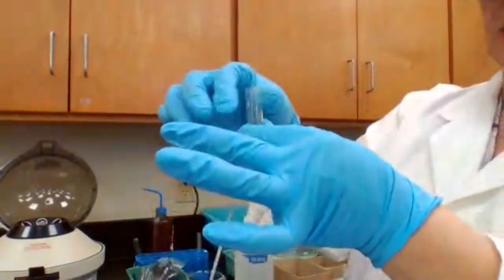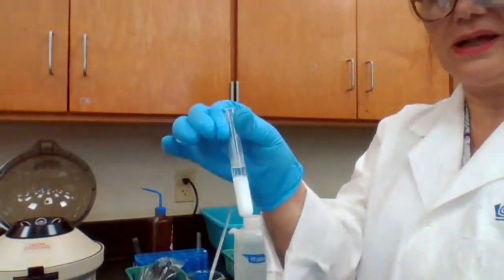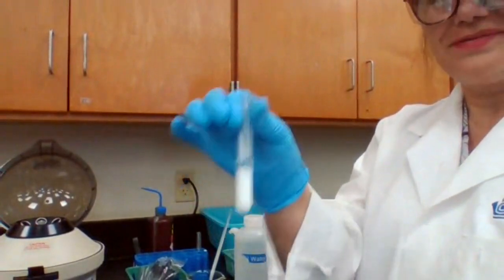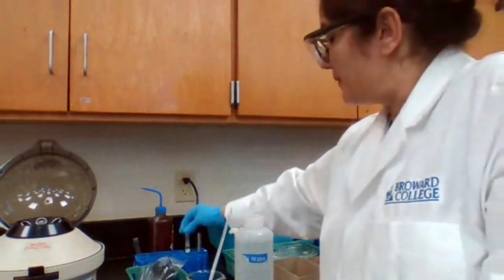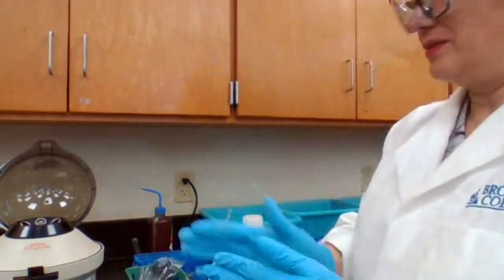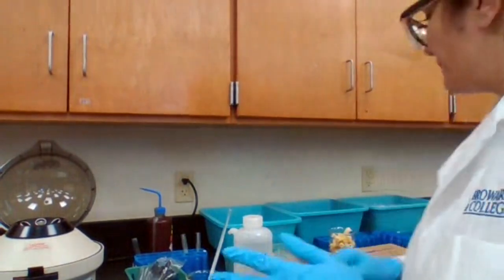You might think we already knew that, but your observation is going to help you identify if you have silver ion in your unknown or not. Okay, you're done with the silver, it goes to the other test tube rack.